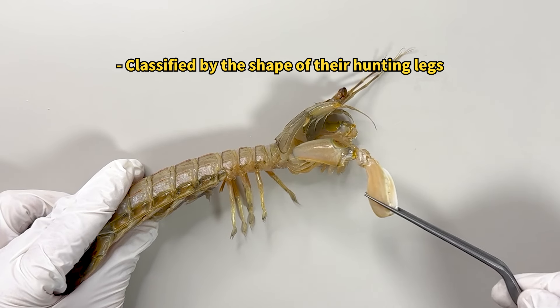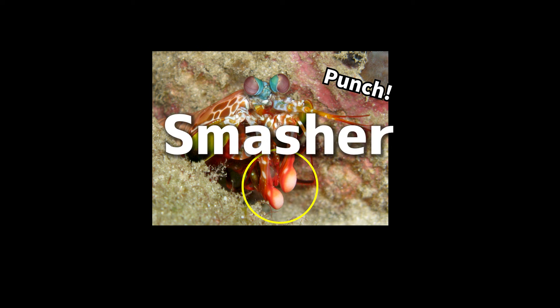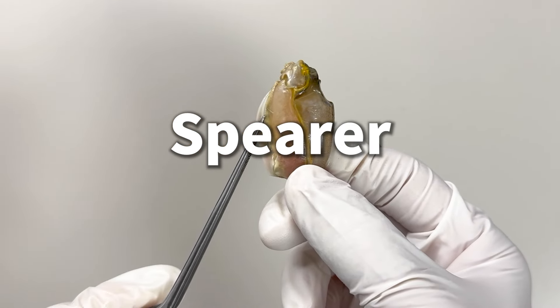Stomatopods are categorized into two main types based on their hunting tactics. There are the smashers, who hunt by striking their prey with club-like appendages, and the spearers, who hunt by stabbing or spearing their prey.